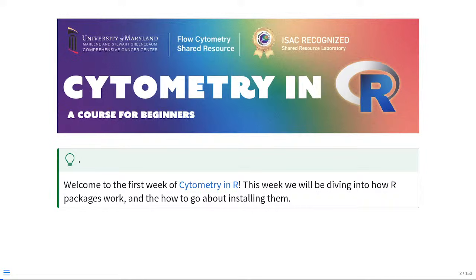And the particular reason why those unsupervised analytical techniques normally get introduced to our field as R packages is partially due to a founder effect. The Bioconductor project started in the early 2000s. The people who wrote the initial bioinformatic tools to analyze flow cytometry data were part of the Bioconductor project, so everything has grown as a contribution of R packages. Now, even if you go to Cyto, every year you'll see there's a couple Python packages. I saw a Julia and a Rust package last year. So there is a little bit of growth in the field as far as other programming languages, but the vast majority of unsupervised analysis continues to be in R.